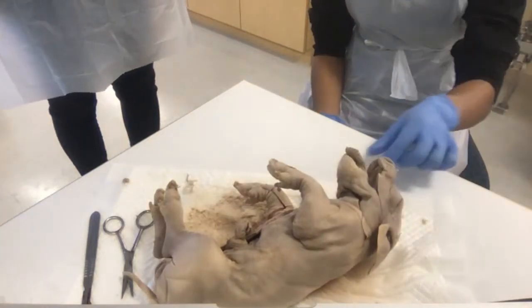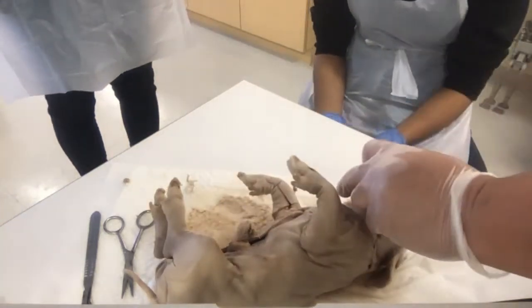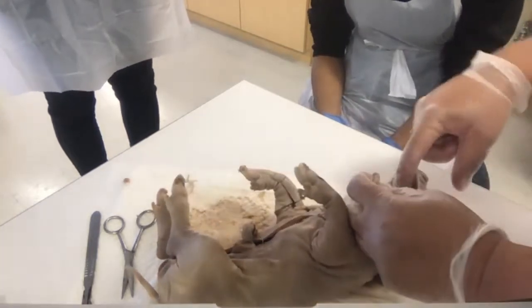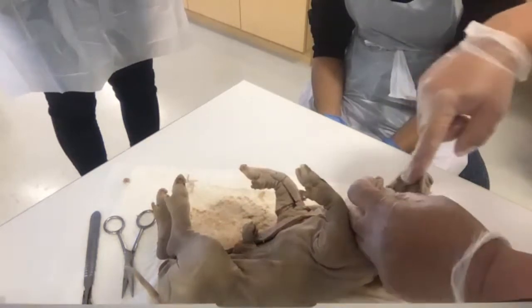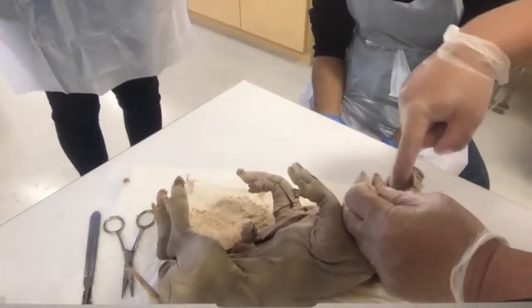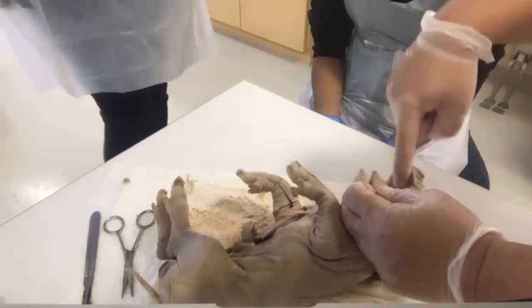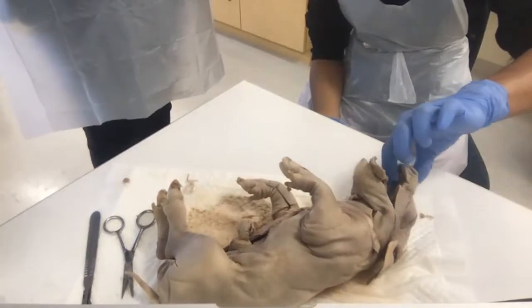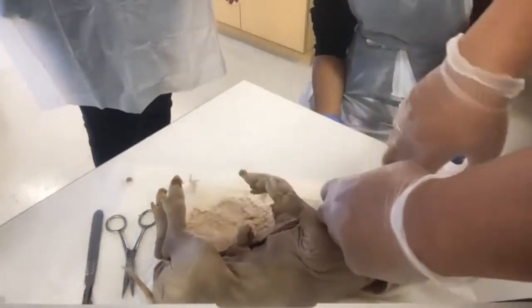And of course, it helps us speak, right? It helps us swallow. And how do we know? Everyone feel this part. Be careful, might have some teeth. Yeah, there's some teeth here, little baby teeth, right? But feel here. Everyone feel this, it's like a washboard and it's hard. Now, stick your finger all the way down here.